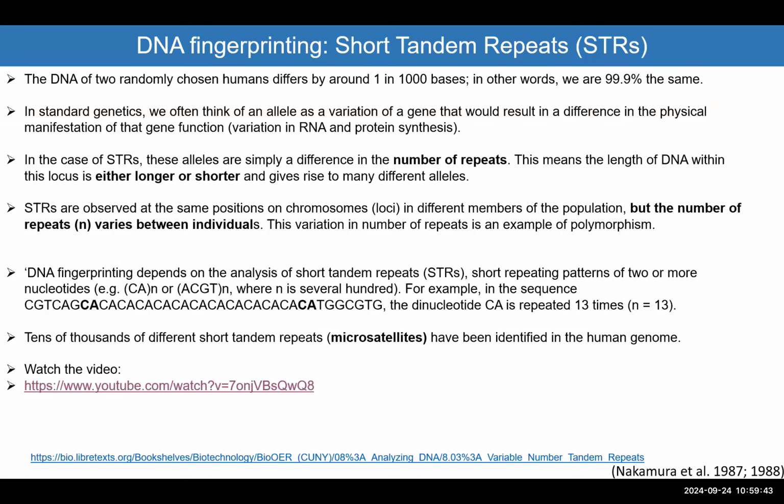Are there any questions up there that I didn't answer? So the difference between the two is simply the number of the repeats and the length of the sequence.